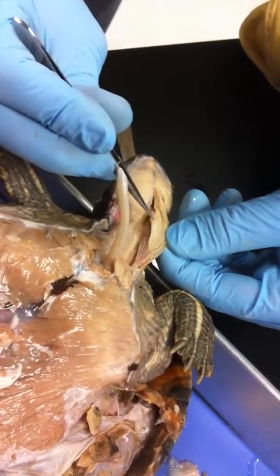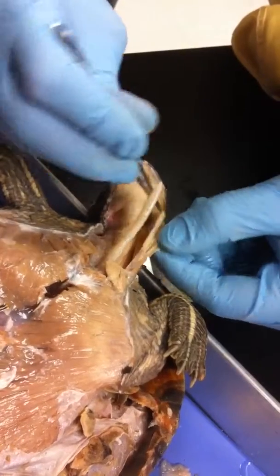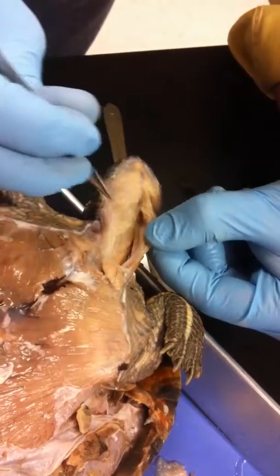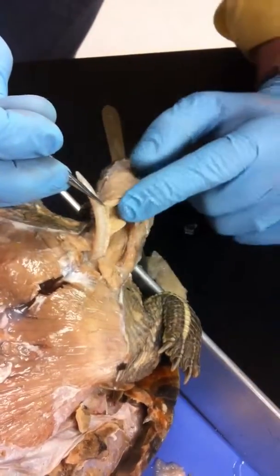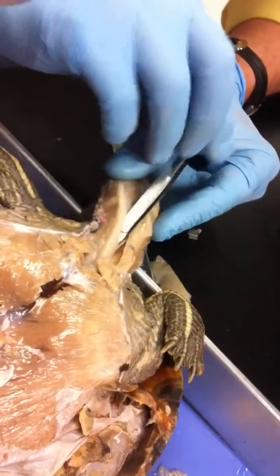What I just did there — that's the esophagus. That's part of the esophagus there. That is the inside of the esophagus, and that would go down into the stomach.